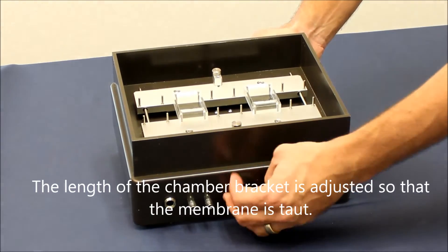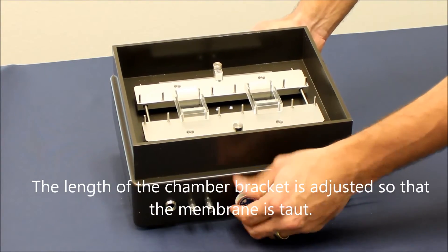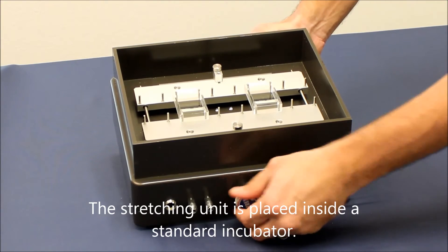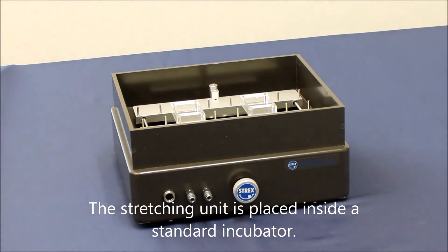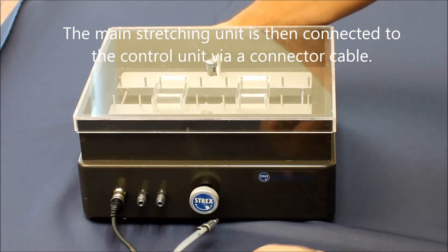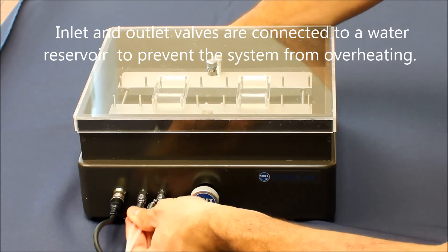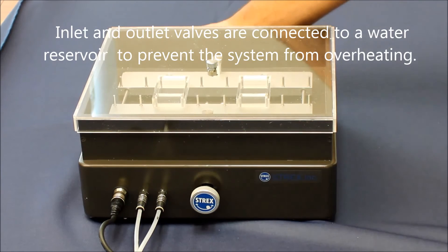The length of the chamber bracket is adjusted so that the membrane is taut. The stretching unit is placed inside a standard incubator. The main stretching unit is then connected to the control unit via connector cable. Inlet and outlet valves are connected to a water reservoir to prevent the system from overheating.